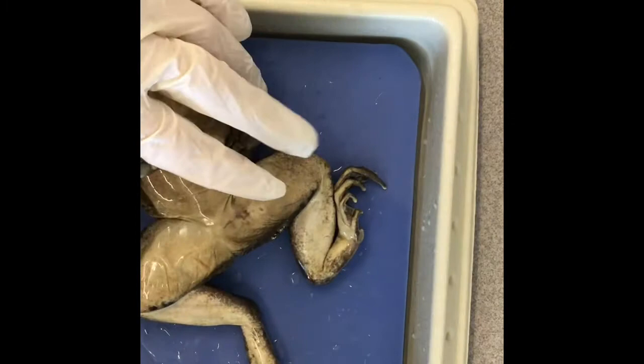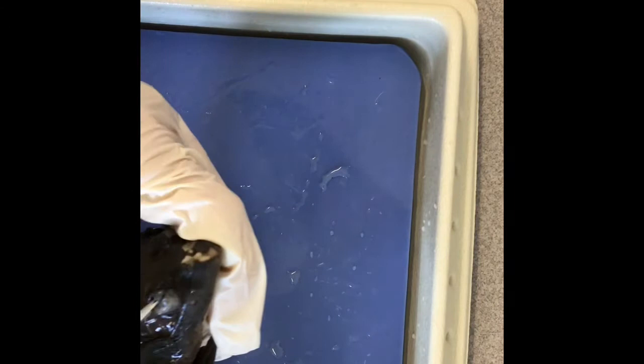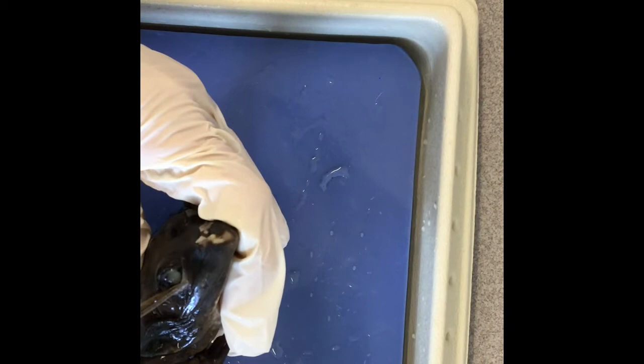We're going to look at the eye next. The nictitating membrane covers the eye — sorry, the nictitating membrane, not tympanic membrane. It covers the eye here and protects it. It's clear.